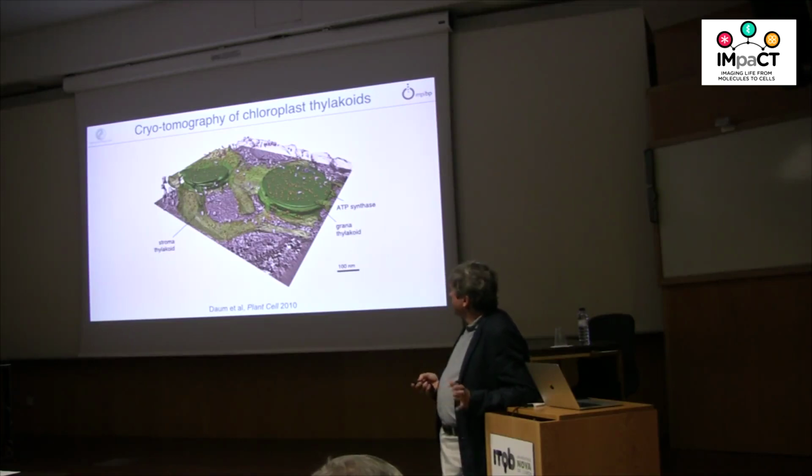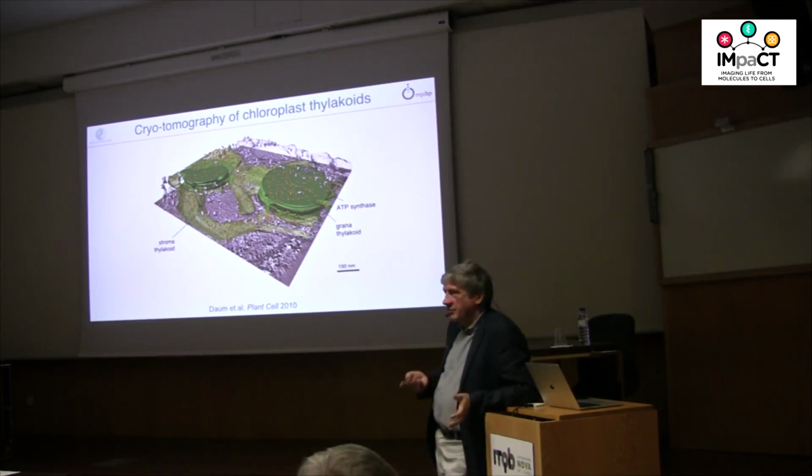But there was no high-resolution structure of it because it doesn't crystallize. When you try to crystallize it, it falls apart. And also, it's in many different conformations, as you will see, and that doesn't help when you want to crystallize something. They all have to be the same. All the molecules have to be the same. This is by definition not the case with the ATP synthase, because they do their job by rotary catalysis, so it means they have different rotary states, and that's bad news for crystallization. That's only one problem. The other problem is they're just not stable, and if you crystallize them, they fall apart. Many people have tried, and many people have failed over the last 4 decades.